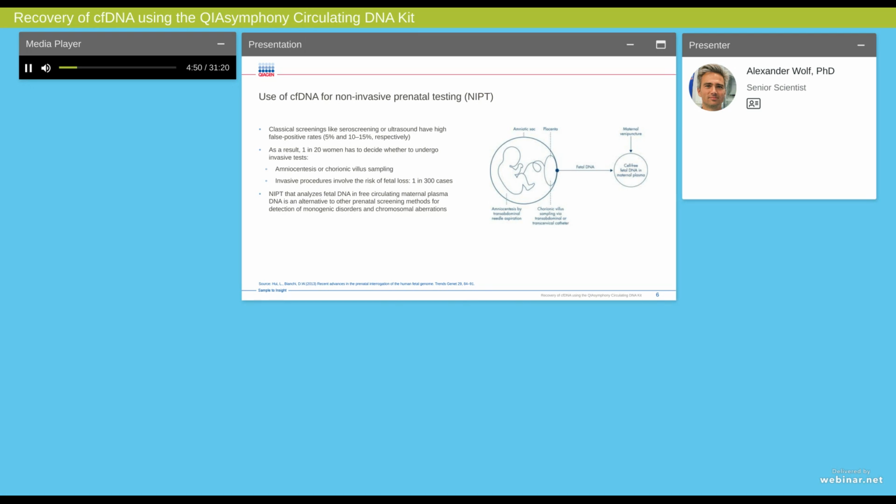Based on these findings, the striking success of non-invasive prenatal testing in the last years can be easily explained, and non-invasive prenatal testing is an essential part of prenatal screening today. Here, the preanalytical and analytical procedures are well harmonized and validated, and will most likely largely substitute amniocentesis within the next few years, or at least will further reduce these invasive diagnostics, which are only required after a positive test result from the liquid biopsy-based assay, focusing on monogenetic disorders or chromosomal aberrations.